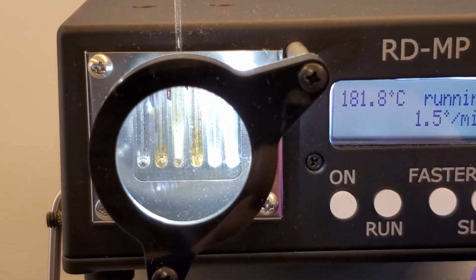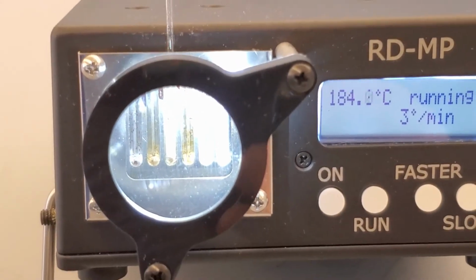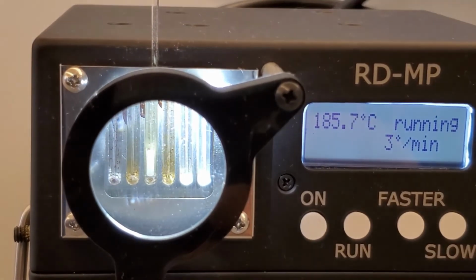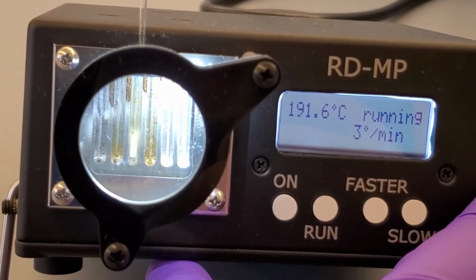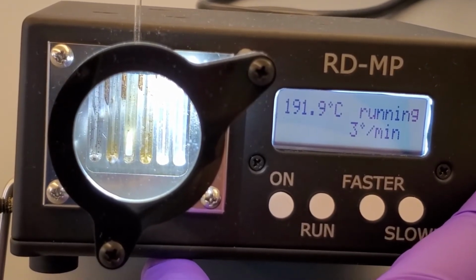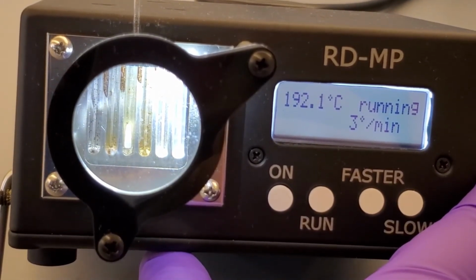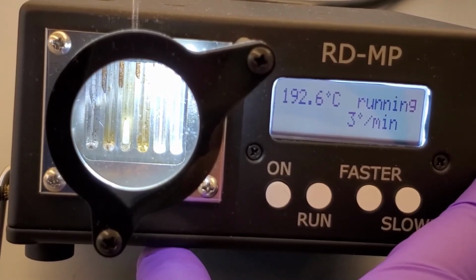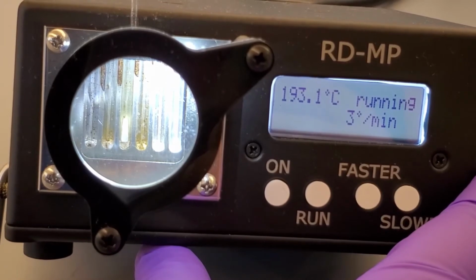When we get to about 20 degrees Celsius below the melting point of borneol and isoborneol, we slow the temperature ramping to 3 degrees Celsius per minute. As we approach the melting point of borneol and isoborneol, we can see the morphology of the crystals start to change, but melting does not occur until we see the presence of liquid.